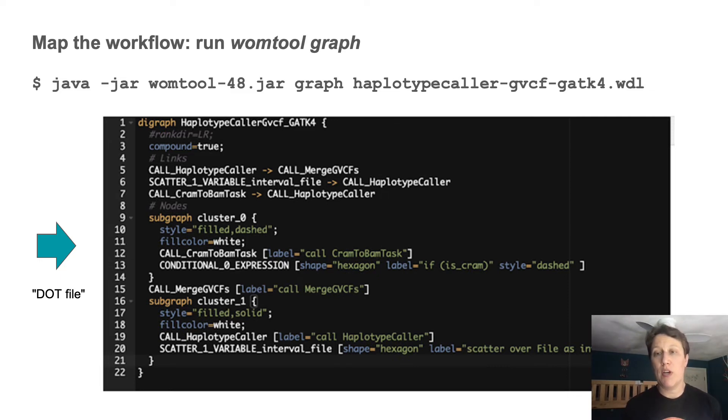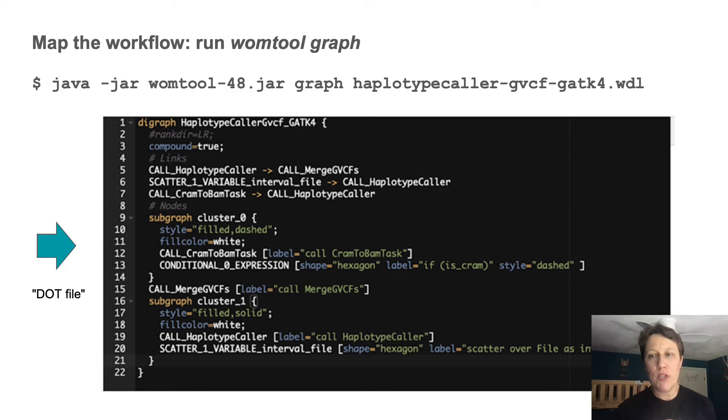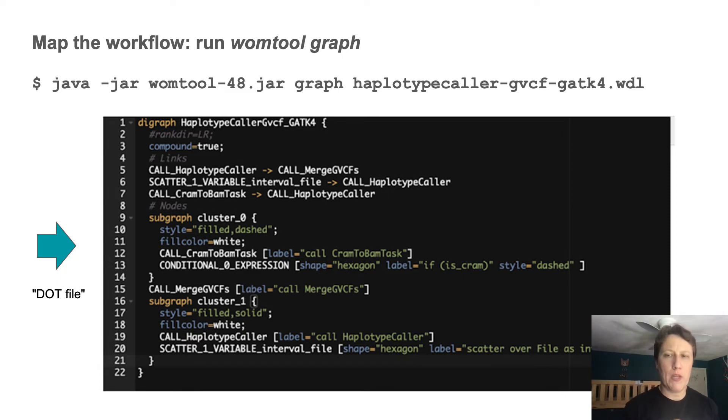And running this simple command line outputs what's called a dot file, which describes the workflow graph in the dot language. It's obviously massively summarized compared to the original Whittle, but still not terribly human readable.